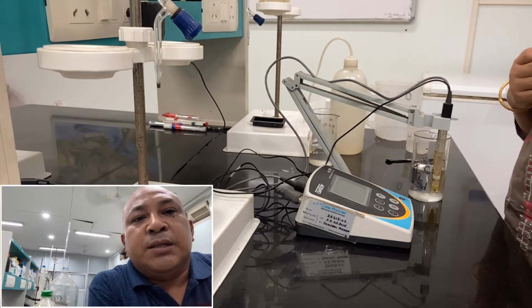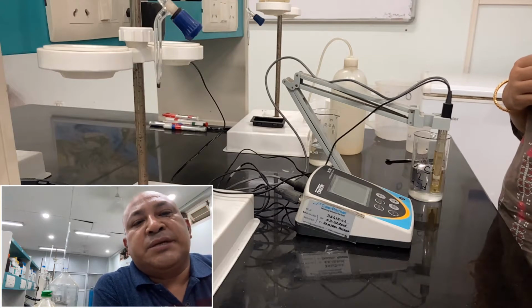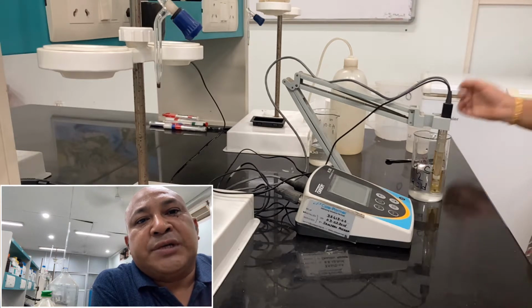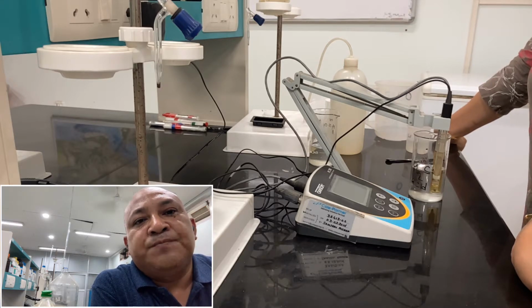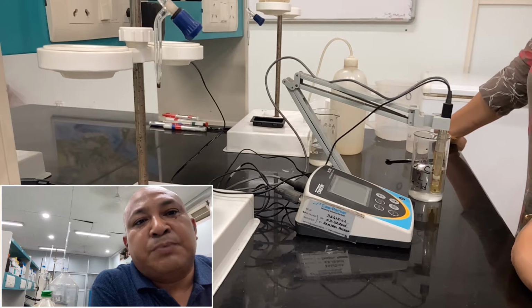Dear students, the experiment is going to be conductivity. Conductivity is the measurement of the presence of ions due to the presence of dissolved solids. The movement of ions is going to give the conductivity to the water itself. So a lot of dissolved solids, maybe due to fertilizers or soil erosion, should be avoided because it's going to hamper drinking or even cement construction purposes.